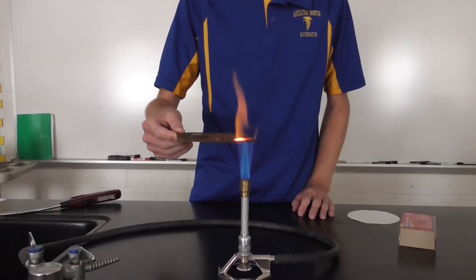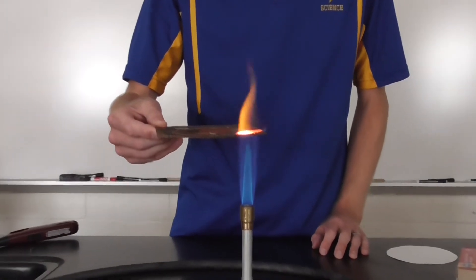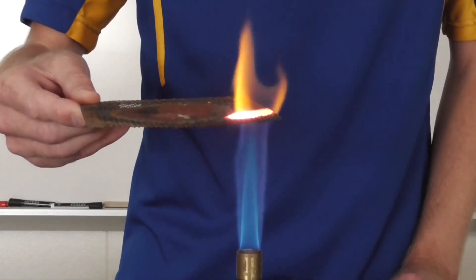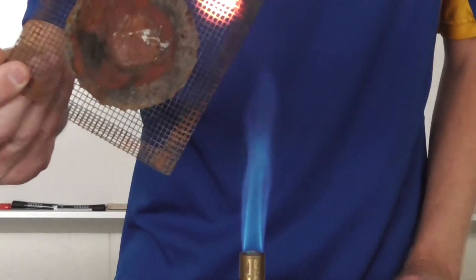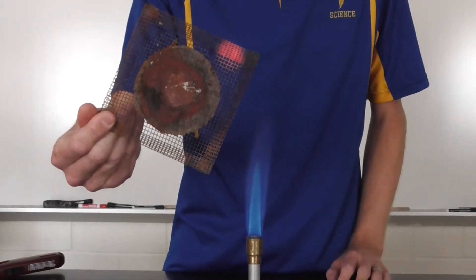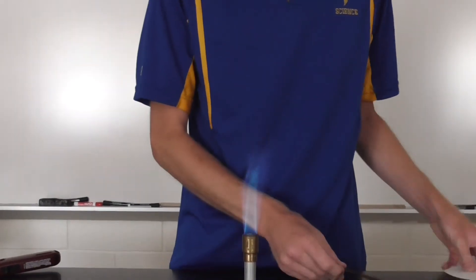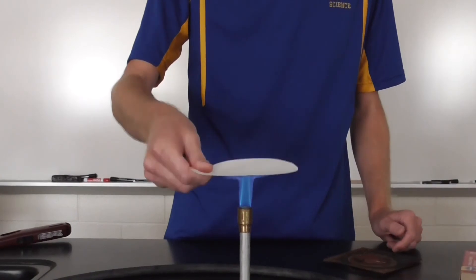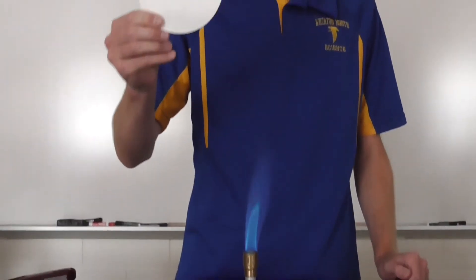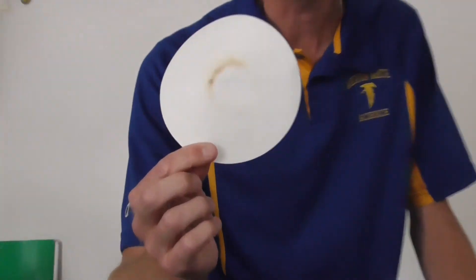The hottest part is at the top of the inner cone. You'll notice when we put the wire mesh there, we achieve a uniform red spot. It can also be demonstrated by burning some filter paper. You can see a little bit that there's a ring that's produced.